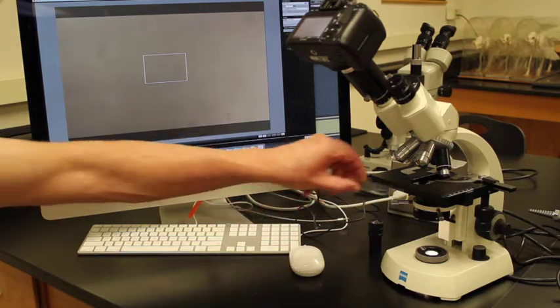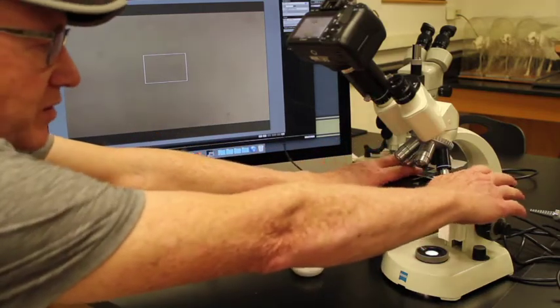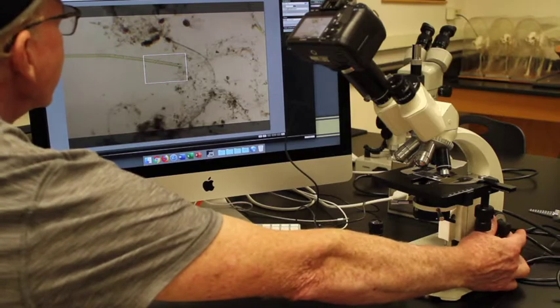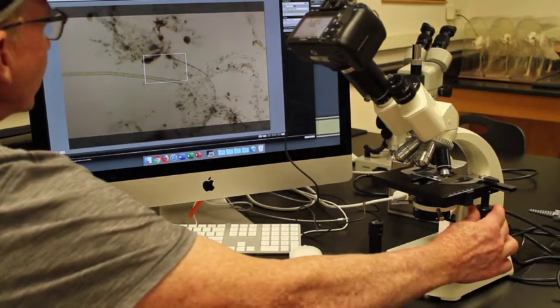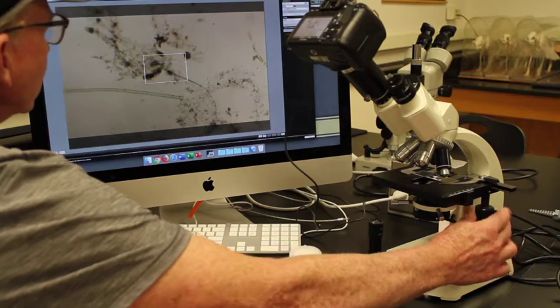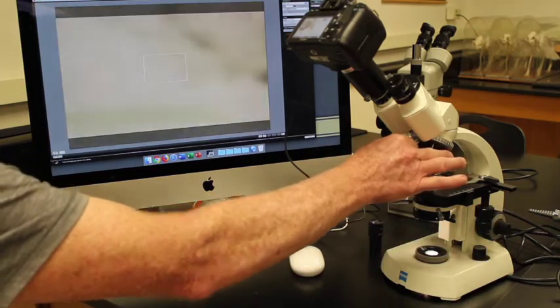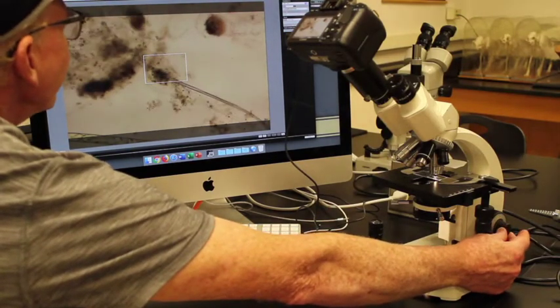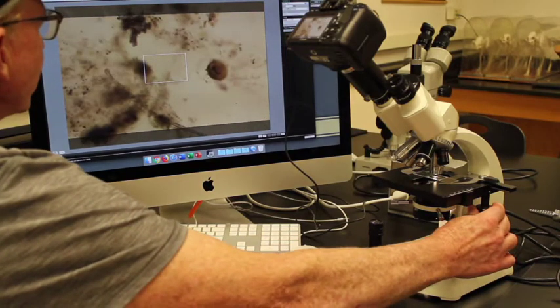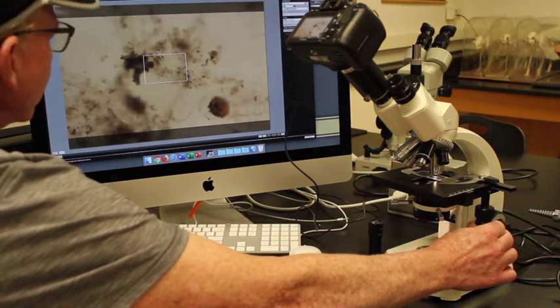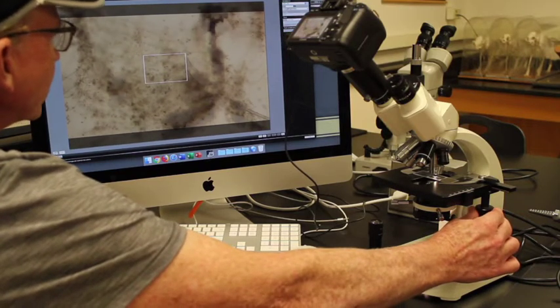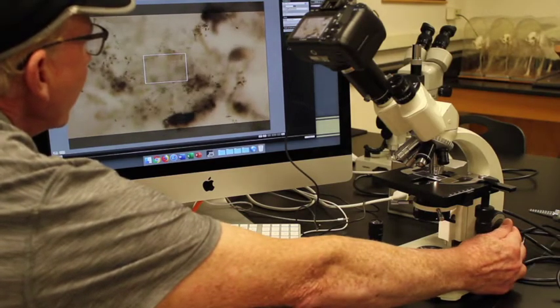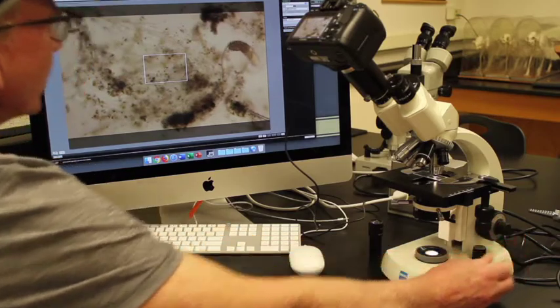For example, here's a slide that I made up. This will be one of the slides that we'll be looking at later in the lab. We'll just throw it in here really fast so that you can see what's going on. And we'll focus it, move it down a little bit, put some stuff in the center that looks cool. Then what I can do is easily switch to a higher magnification. Focus it. Center the object. There's actually several things on here which are pretty neat. I just have to choose one. Center it. Focus. Then we can center it again and look at various objects.